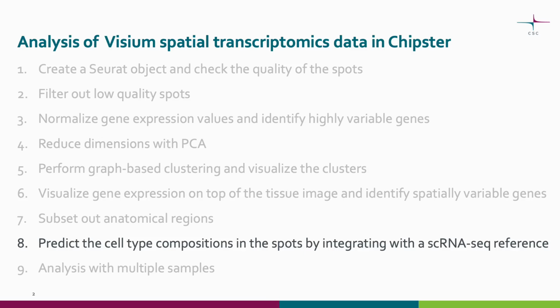The first tool normalizes and runs dimensionality reduction for the reference data, after which the spatial data is integrated with the single-cell reference using anchor-based integration. The second tool visualizes the predicted underlying composition of cell types in each spatial spot after integration.